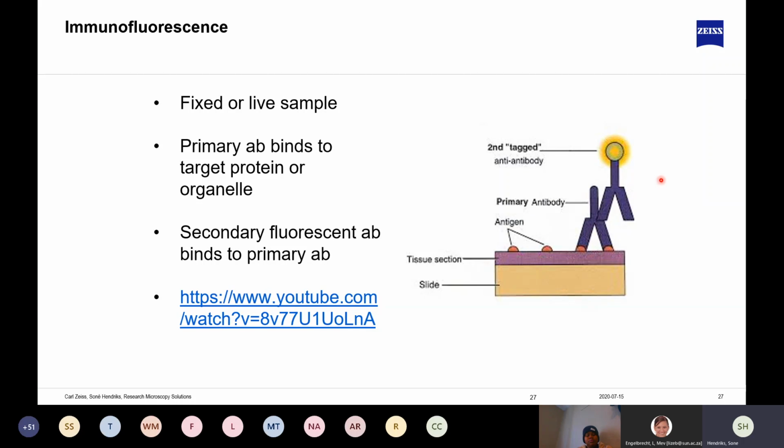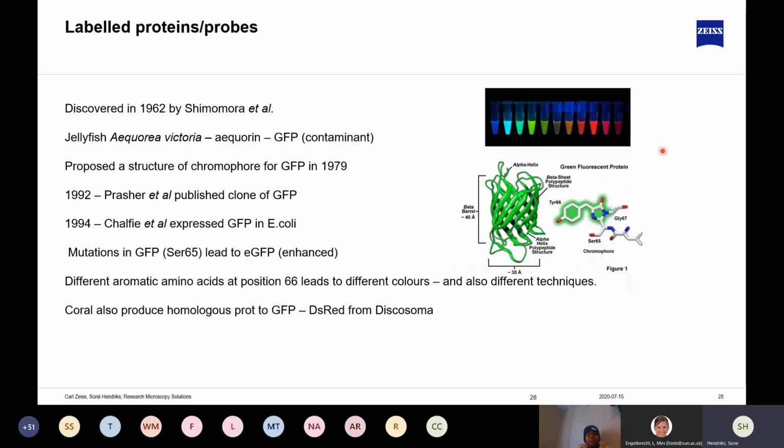And as I mentioned, we're working with light-starved techniques, so if you can do anything to enhance the signal, it should be a consideration in your sample prep. Of course, there are many ways in a protocol where you can do some fault finding, and I'm sure that some of this can be discussed in some of the groups on Friday. Then you can also have labeled proteins or proteins coupled with probes. These are just some examples.